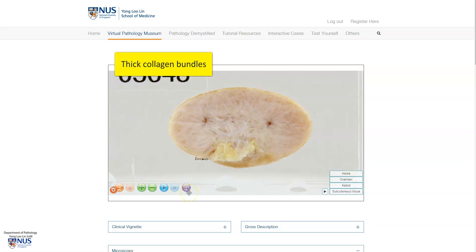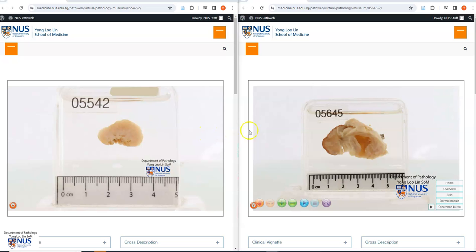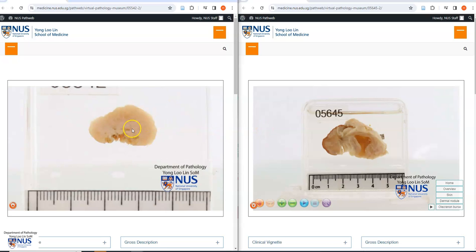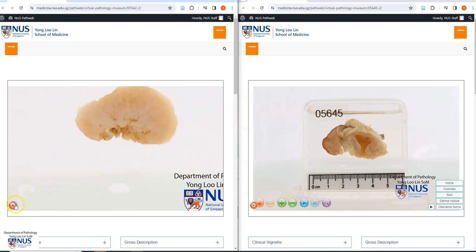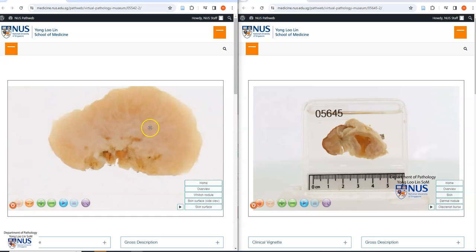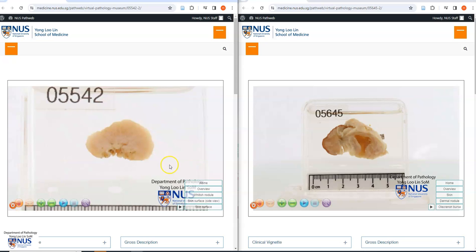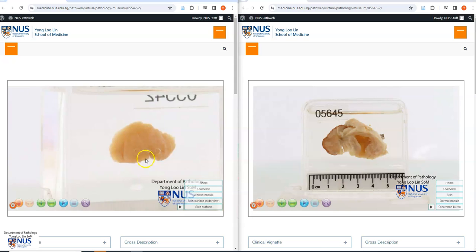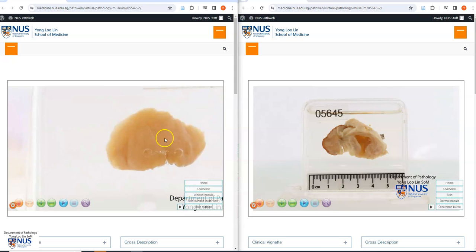Let's look at another example. Here are two further examples from our virtual pathology museum. On the left, we can see the cut surface, and it looks very similar to the previous case with this whitish, collagenous cut surface. And again, this is covered by intact, non-hair-bearing skin.